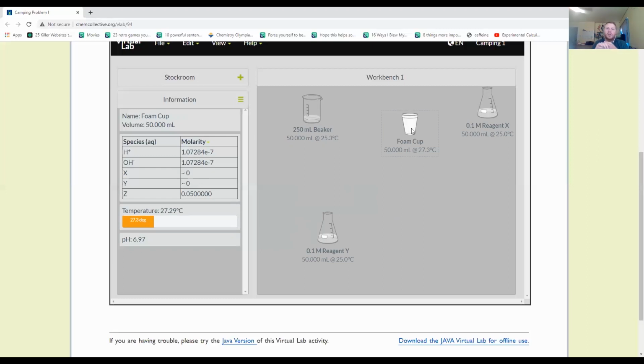That piece of instrumentation is known as a calorimeter. So you're able to actually watch the heat of that specific reaction. Now, yes, it is a styrofoam cup. It is a foam cup, but it's effective because whenever you're drinking coffee from a styrofoam cup or something like that, it's insulated from the environment. So any sort of draft of air that blows past it, it's not going to cause the solution to drop very quickly. So that's a very important detail of this experiment.